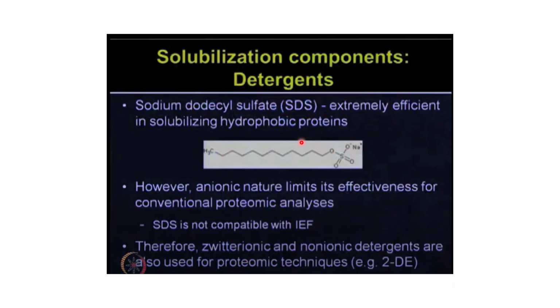Also, you can use certain detergents like SDS, which is extremely effective in solubilizing hydrophobic proteins, but it is not compatible with isoelectric focusing. So you cannot use SDS if your further aim of protein analysis is isoelectric focusing. That's what we were discussing, right?